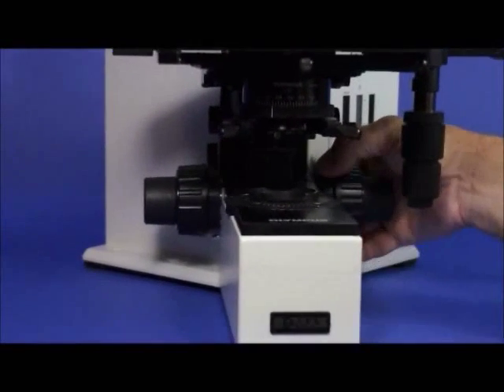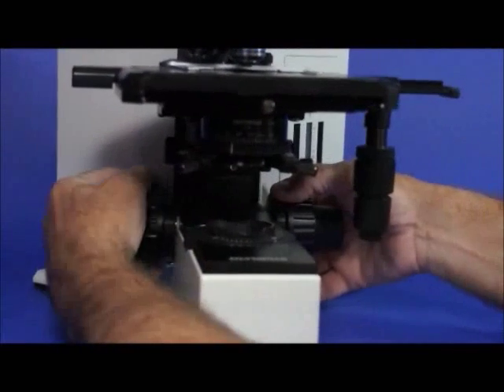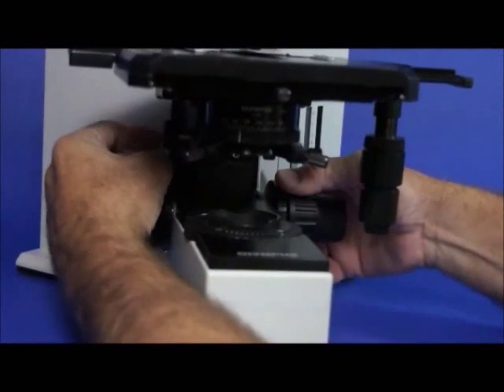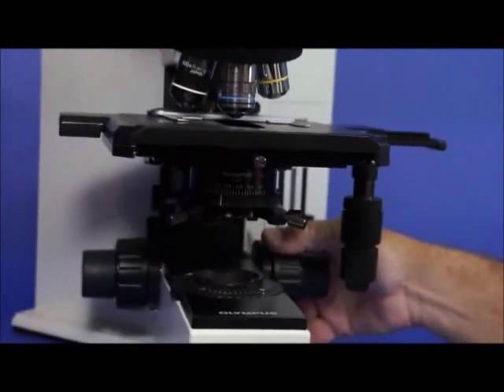There's a tension adjustment here on the right side and a stage brake on the left side, which prevents you from racking your specimen material into the objective lens.